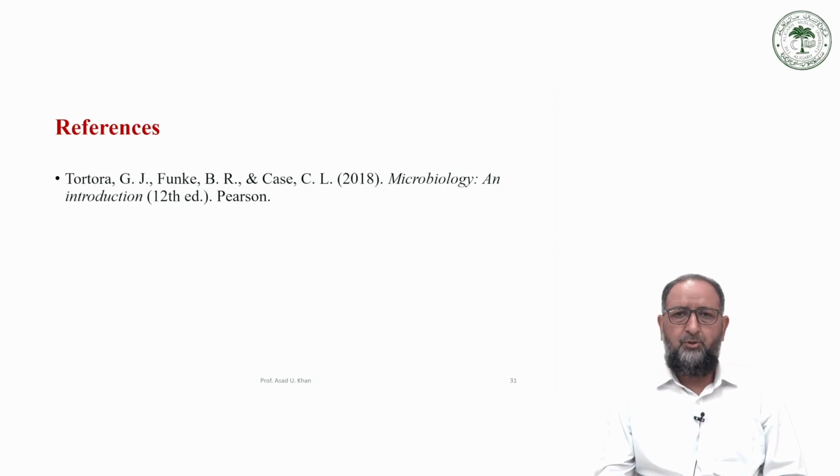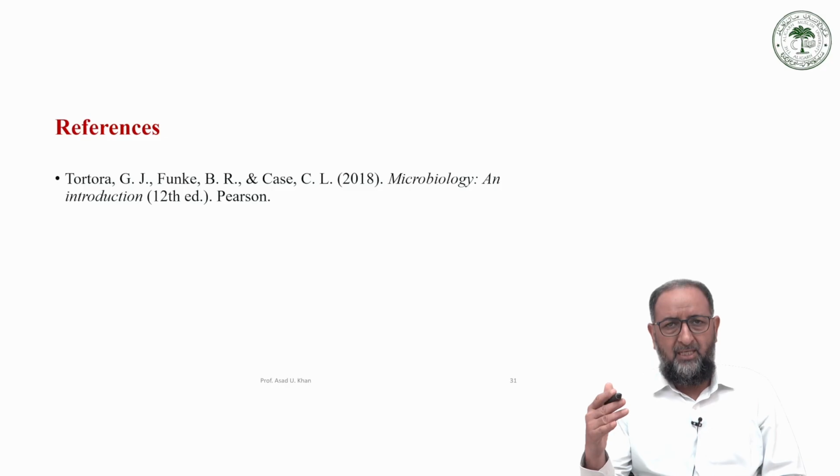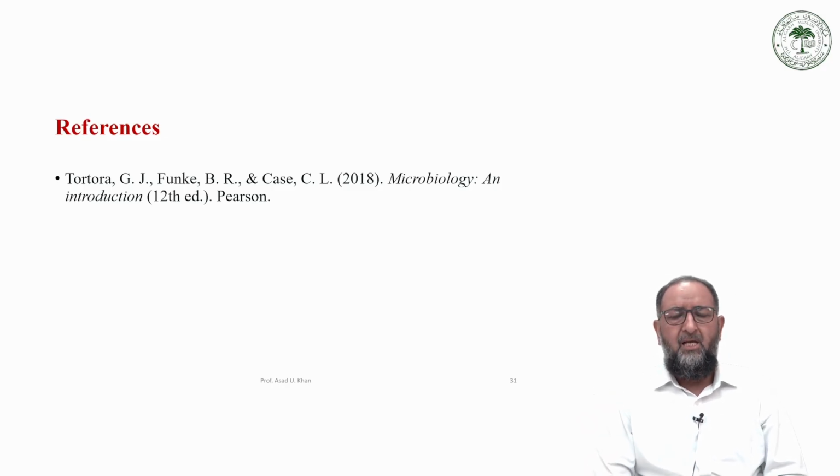Yes, the answer to this question is that it depends on your situation, your experimental condition, your laboratory conditions, and the application and purpose for which you are counting. For example, if you are given the task of finding the viable count of cells in a given culture, say a bacterial culture from clinical isolates, then definitely you go with the viable count method.